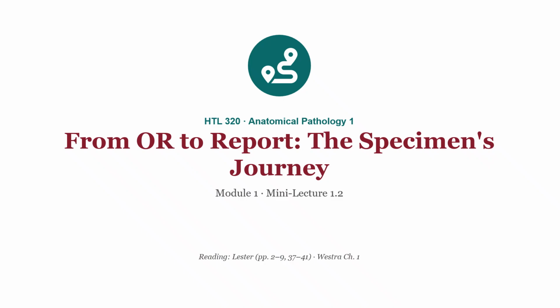Keep one thing in mind as we go. The steps that histotechnology owns come early in this chain, and everything downstream depends on them being done right. This lecture connects directly to your Lester reading on the general approach to the specimen and the surgical pathology report. So, let's follow the specimen, shall we?